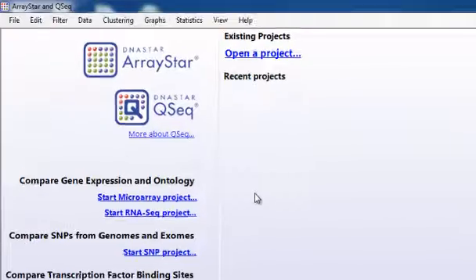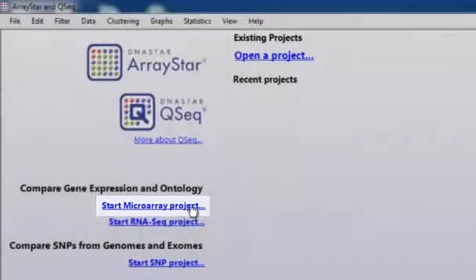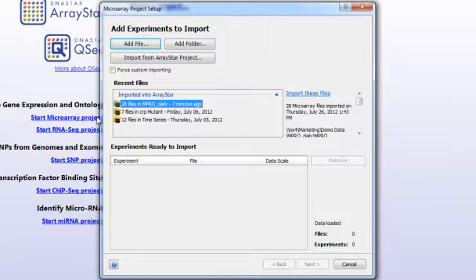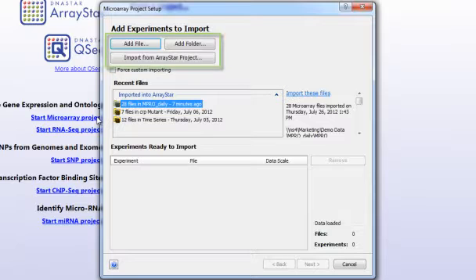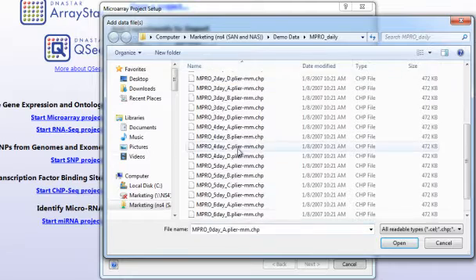To import a microarray experiment, begin by selecting the Start Microarray Project Experiment Type from the Welcome screen. This will open the Add Experiments to Import dialog. ArrayStar supports a variety of microarray files, including Affymetrix, NimbleGen, Illumina, and Agilent, as well as any user-defined delimited text file. To load files, simply click Add File, Add Folder, or Import from ArrayStar Project.